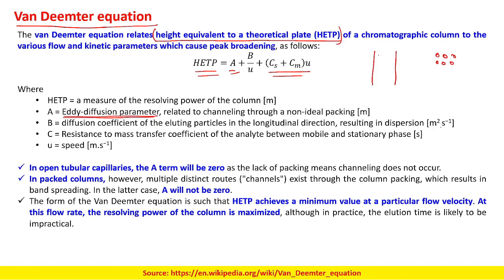However, practically is that possible? Practically it is not possible. Okay. So what you will be having is the particles of different sizes and different shapes. Obviously there will be some similarity, but what I mean to say is that there would be some deviations from an idealistic character.